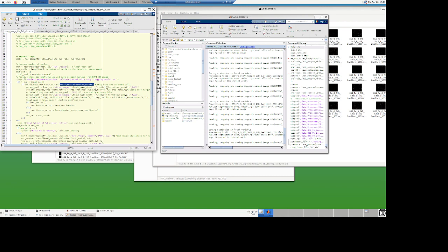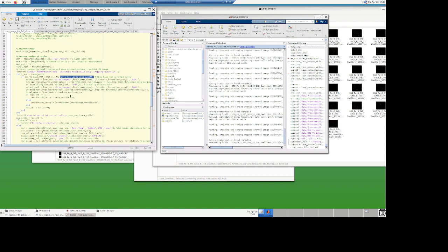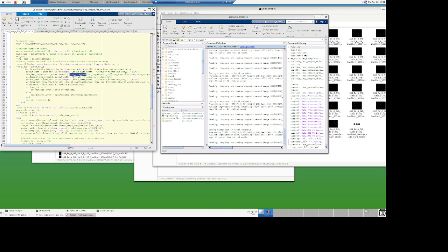And if that's the case, then I say keep the nucleus and crop all the other images. So I crop the DAPI first, which is the nucleus image. It's only a 2D image. I have a cool function that I wrote called crop from mask. I give it the initial image, I give the mask, and I say mask equal iNuc, so it only keeps one nucleus, and then it crops it.